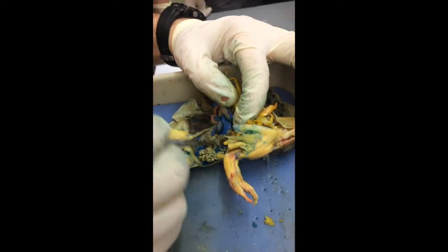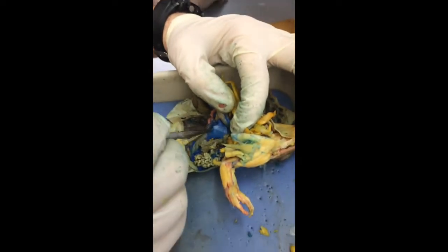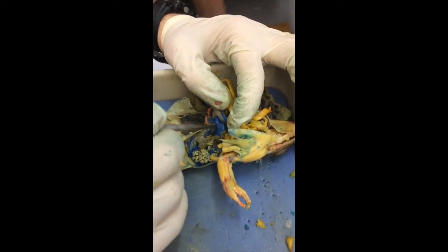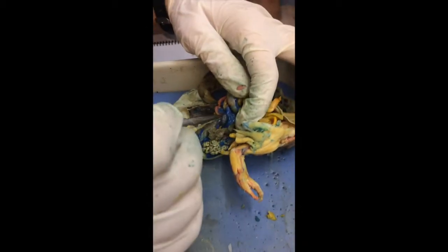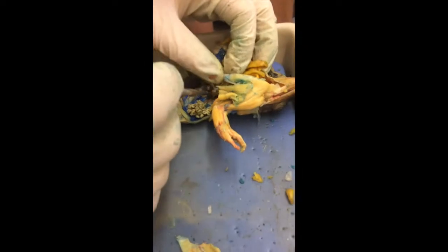Okay, here's the spleen. This ball right here, attached to the mesentery. Okay, this is the spleen, this raisin thing right there. What's it called again? This is the spleen. I can't see it because his hand is in the way. Do you see it? Yeah. Okay. All right.